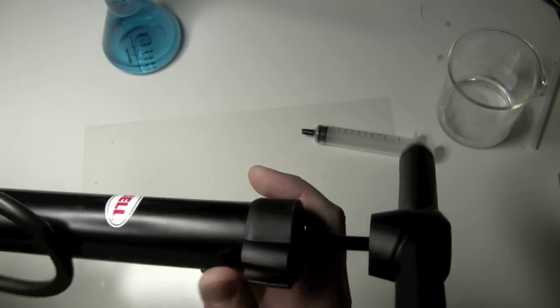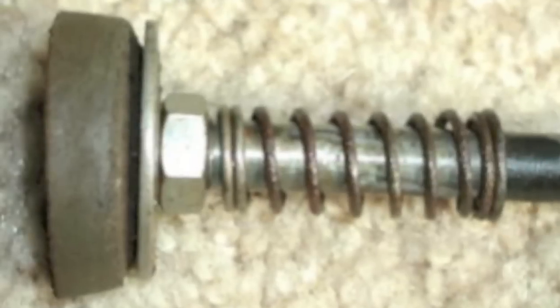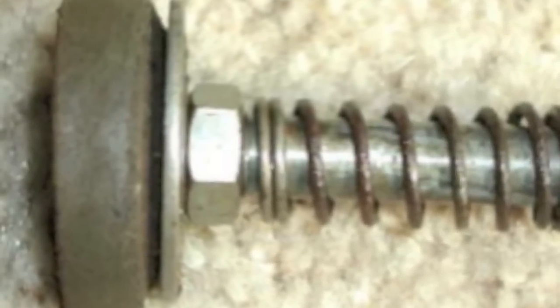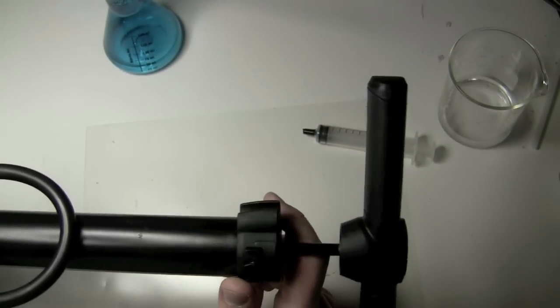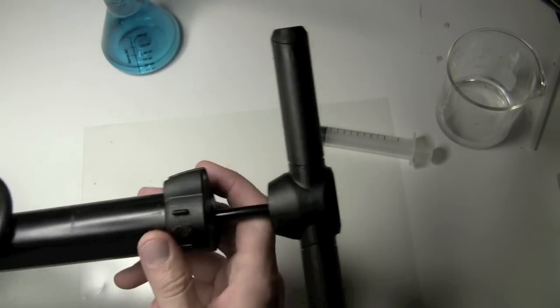Building a vacuum pump once was easy. You just get a bicycle pump like this one and reverse the rubber seal at the end of the plunger. Modern pumps have a different construction and reversing them is a bit more complicated than it was before.